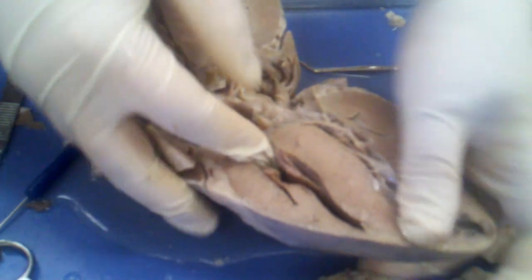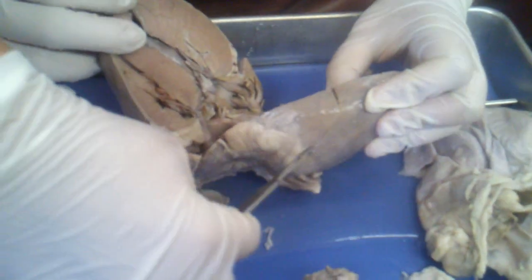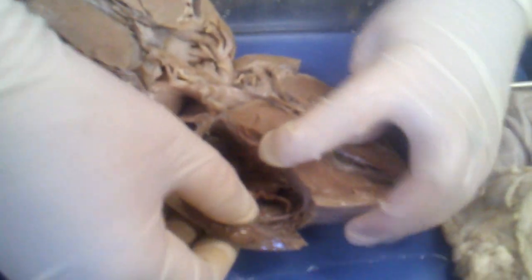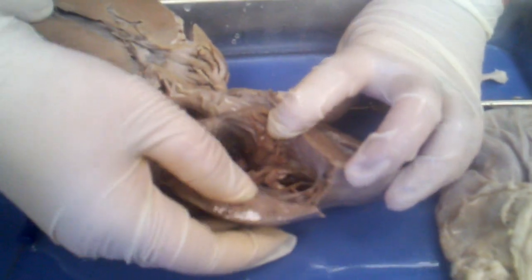The chordae tendineae — let me cut this open so we can see it better. There's the chordae tendineae, and papillary muscles as well. Totally like the chords and stuff.